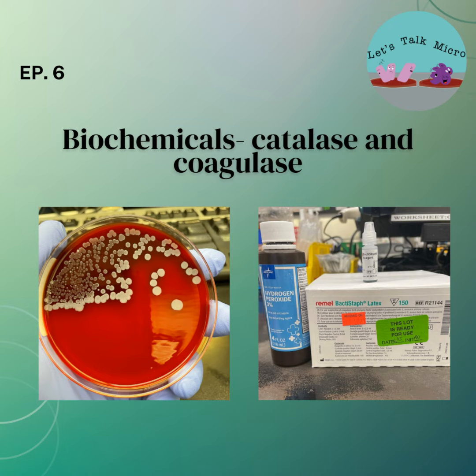On a negative result, there's no clumping, or maybe you may see one or two clumps with a murky background. With these results, if you have a beta hemolytic, coagulase positive organism, that's good enough to call it Staph aureus. And if it's non-hemolytic and coagulase negative, it is good enough to call it coagulase negative staph.